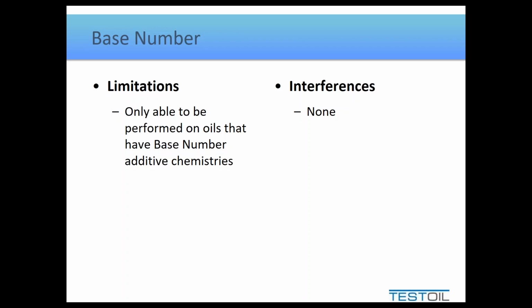You could either count the living, which is like counting base number, it's the ability to fight, or you could count the dead, and that is the damage that's done. The side with the most still fighting is the side that's winning. The side with the most that is dead is the side that is losing. So either way, you could figure out which way the battle is going. You do not need to do both, is my point.